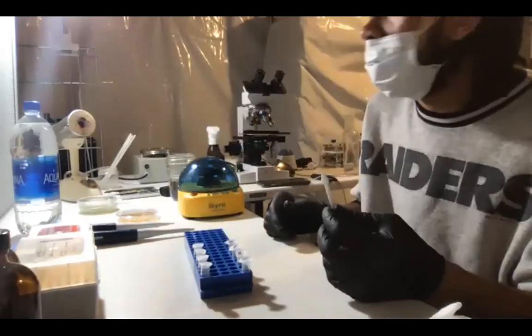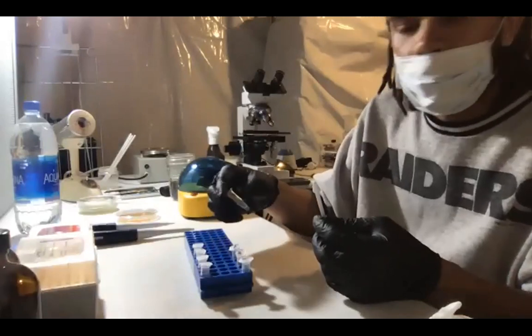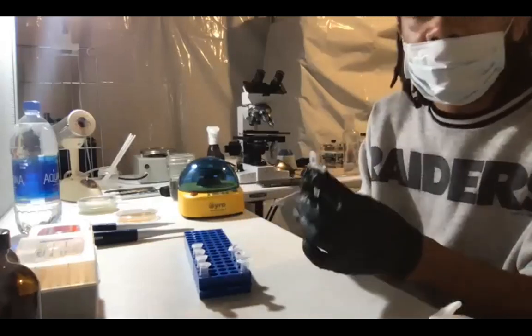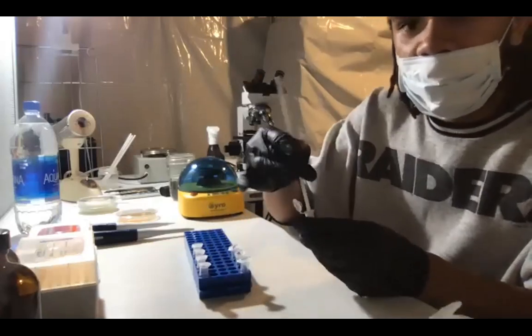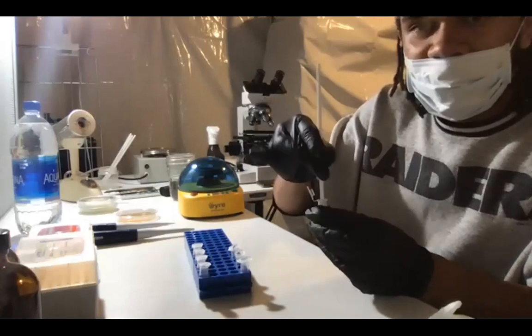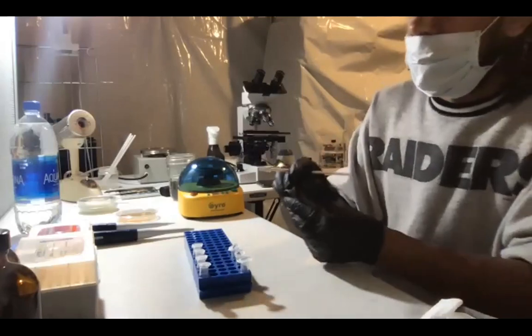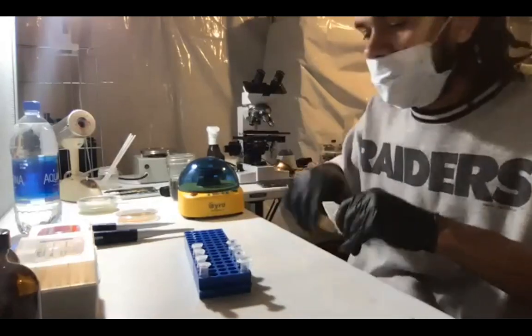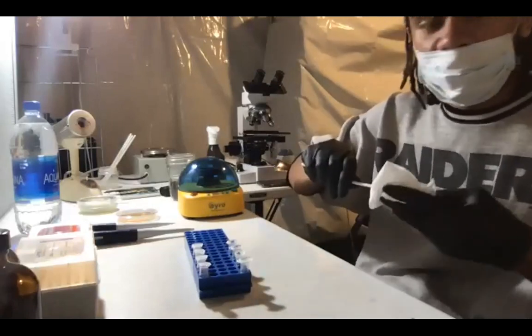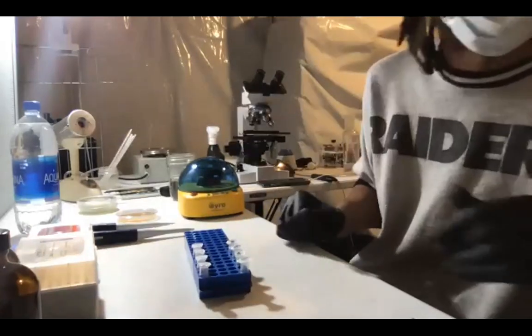So typically what I do is I'll put it in a little jar and I'll put it in boiling water. But I have a magnetic stir bar that I got from Biotech Without Borders, and it heats up. It doesn't get all the way to 95 degrees Celsius, but it still increases my chances of success. But with the magnetic stir bar, I can't put the centrifuge tubes directly on it or the plastic will melt. These centrifuge tubes are meant to be heated up, so it gets so hot that it melts this plastic that's supposed to be able to get hot.